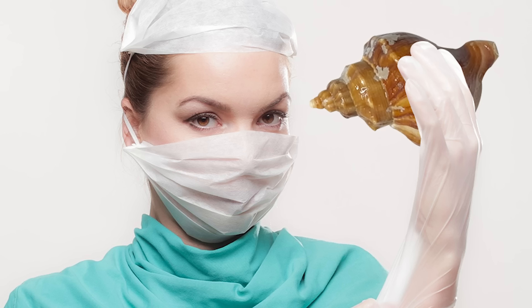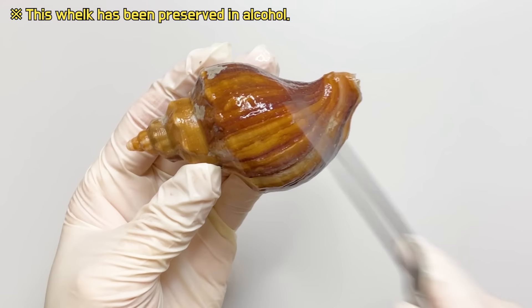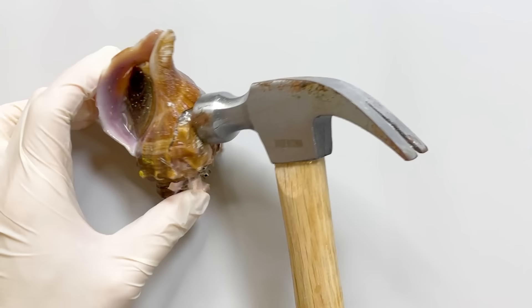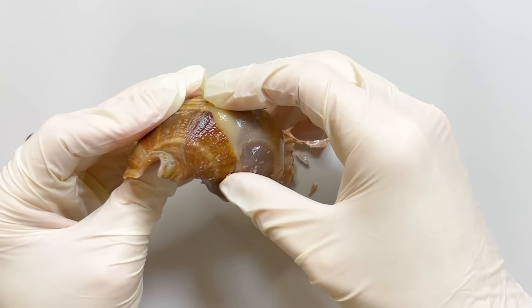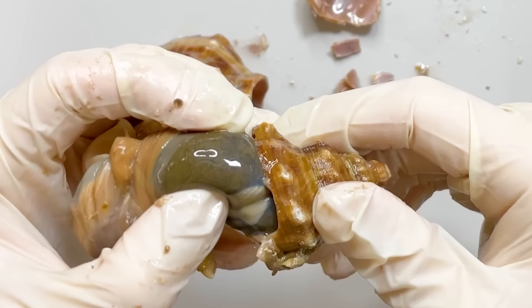Now, let's begin the dissection of the whelk. To see the internal structures, we need to break open the shell. Using a hammer, break open the shell and then carefully remove the soft body. By gripping the upper part of the shell and twisting it, you can cleanly separate it.